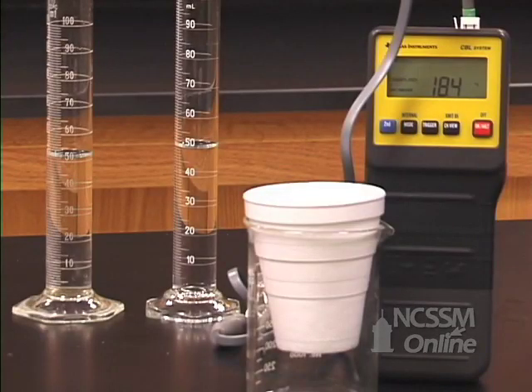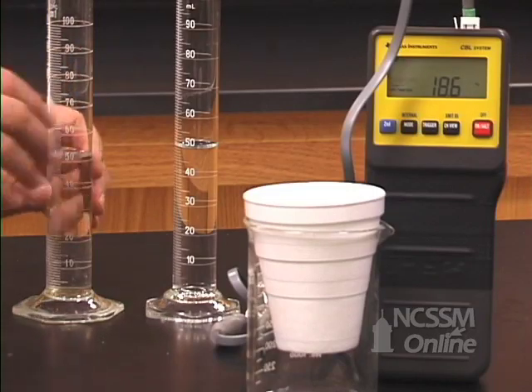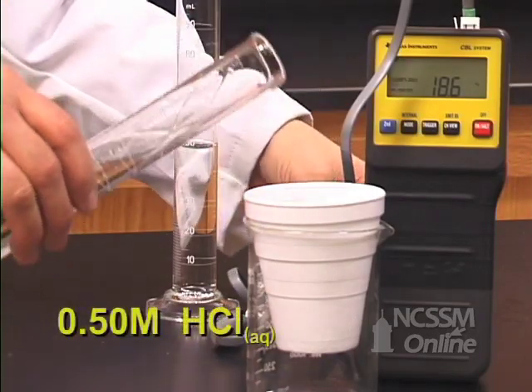In the second part of our Hess's Law lab, we are going to measure the heat of neutralization of an aqueous solution of sodium hydroxide with an aqueous solution of HCl. We place the HCl into the calorimeter.